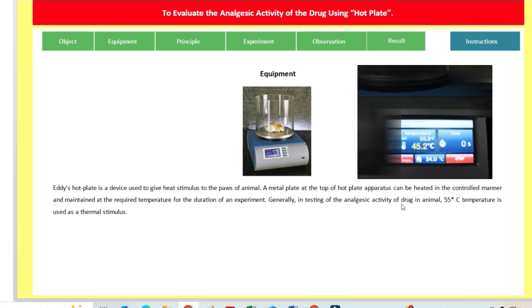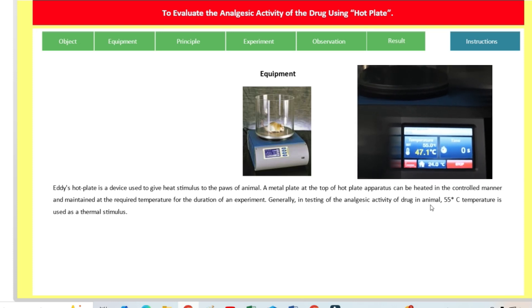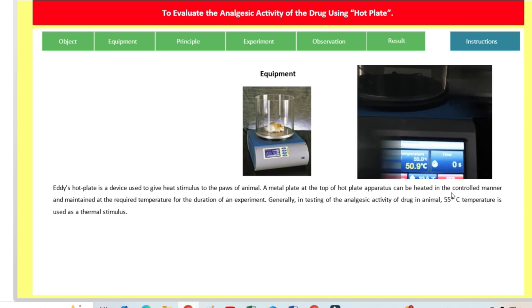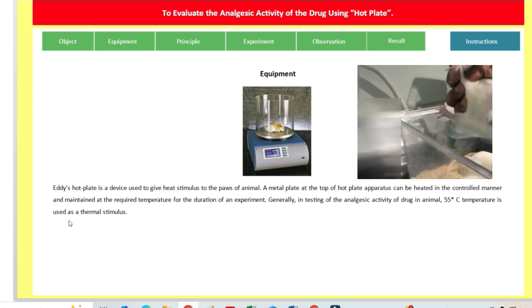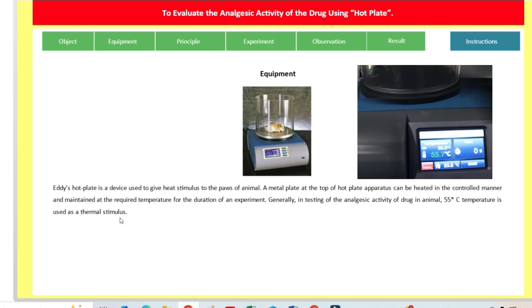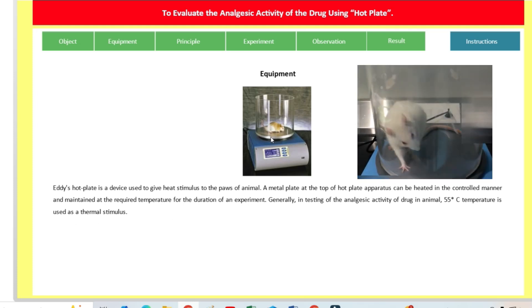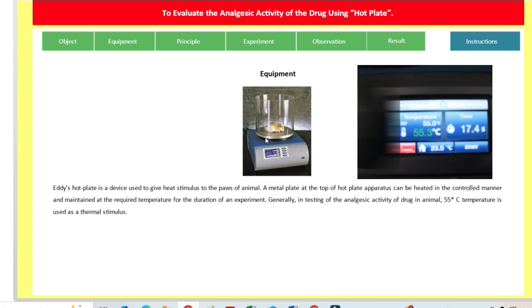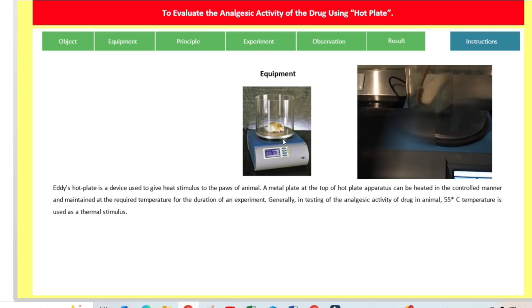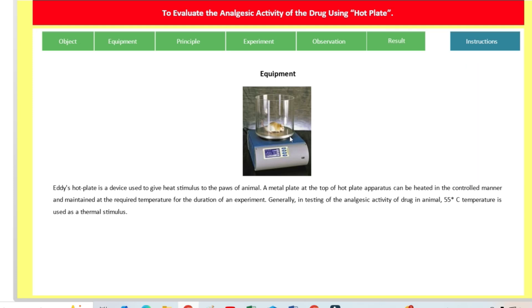For testing the analgesic activity of a drug in animals, 55°C temperature is used as a thermal stimulus. The plate is heated up to 55°C, which we have to maintain while we are introducing the animals onto the hot plate.